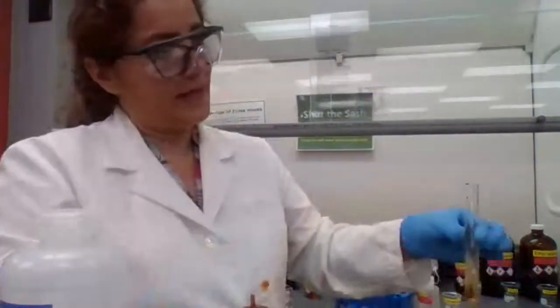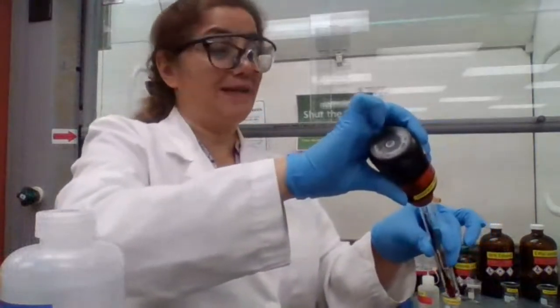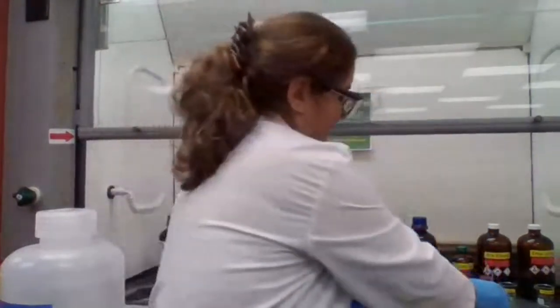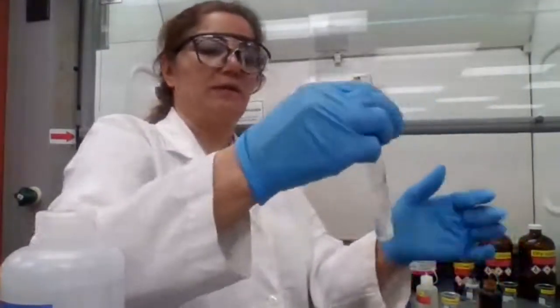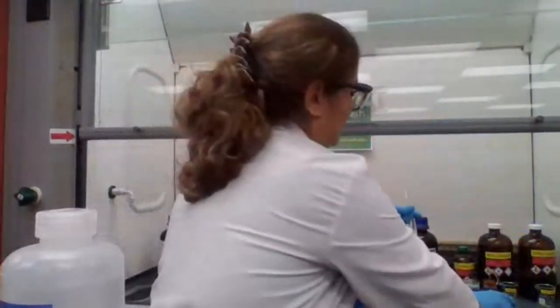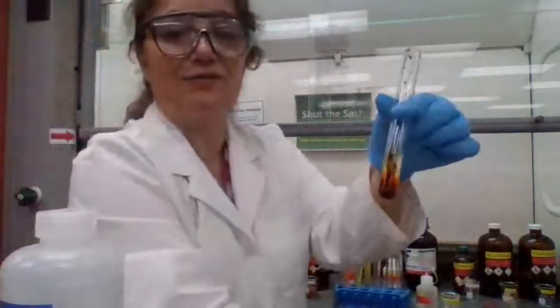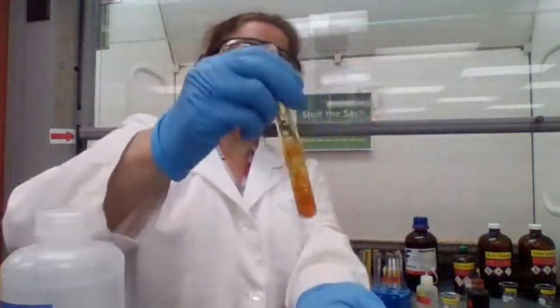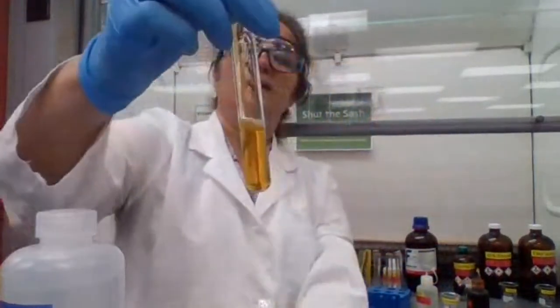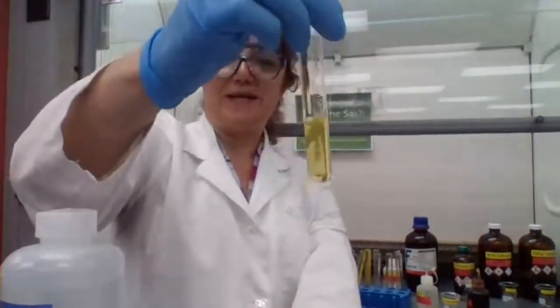Well, I know cyclohexanone is not a methyl ketone and is not going to form a precipitate. I just want to make sure that if it's an unknown, we know how it looks for negative test results. So you keep adding iodine and no precipitate forms. The color is now stable.